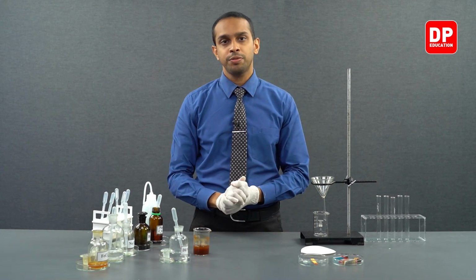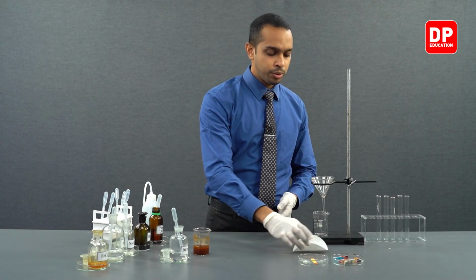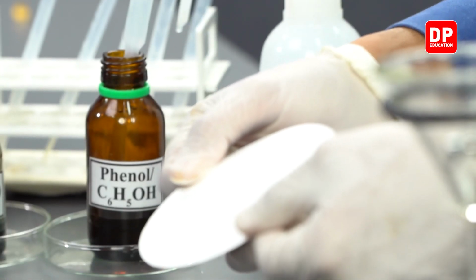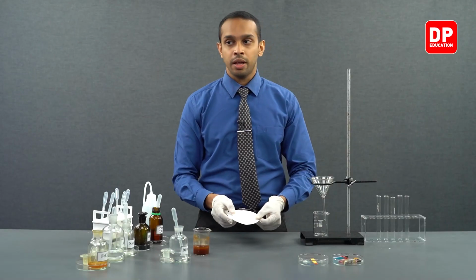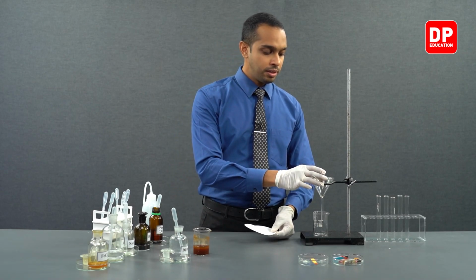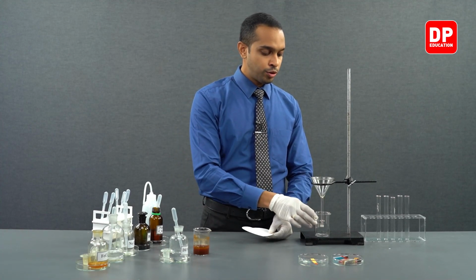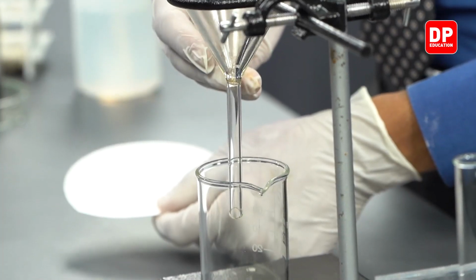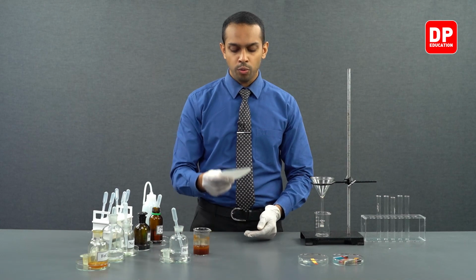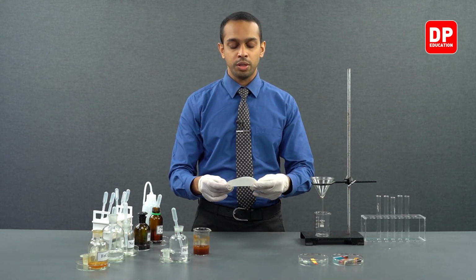So, in order to filter this precipitate out from this suspension, we will be using a filter paper such as this, and we will be using this setup. We have our funnel set up here connected to a retort stand holding up the funnel, which will be allowing the filtrate to be filtered out into a beaker. Now, when you are using a filter paper, you have to make sure that you use it the right way.